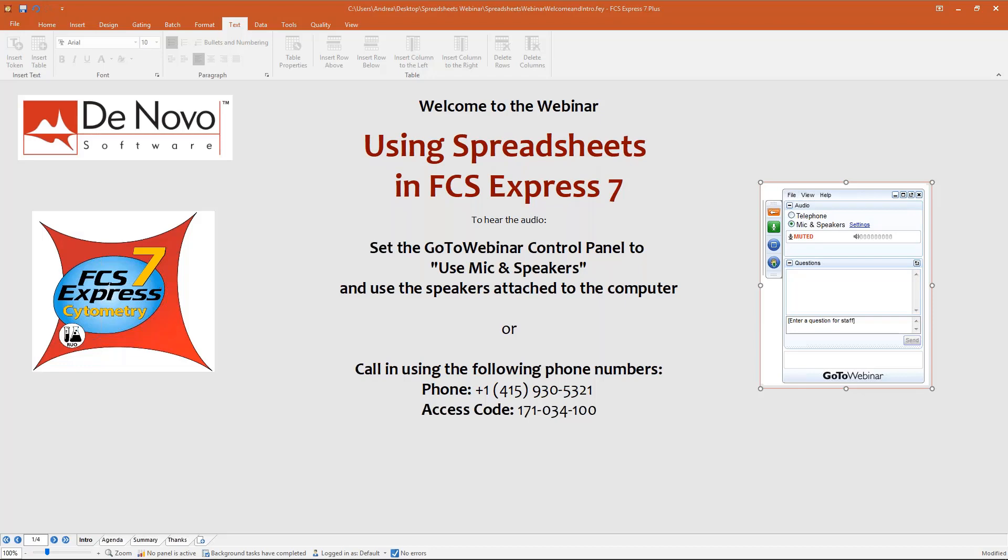Thanks everyone for joining this webinar on using spreadsheets in FCS Express 7. Keia Ghosh is on the line to take care of questions in real time. I will try to answer questions directly, but if I'm not able to during the presentation, Keia will take care of you.